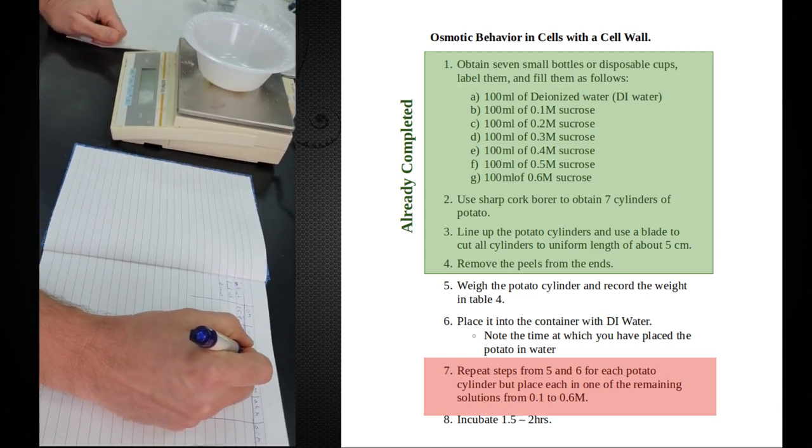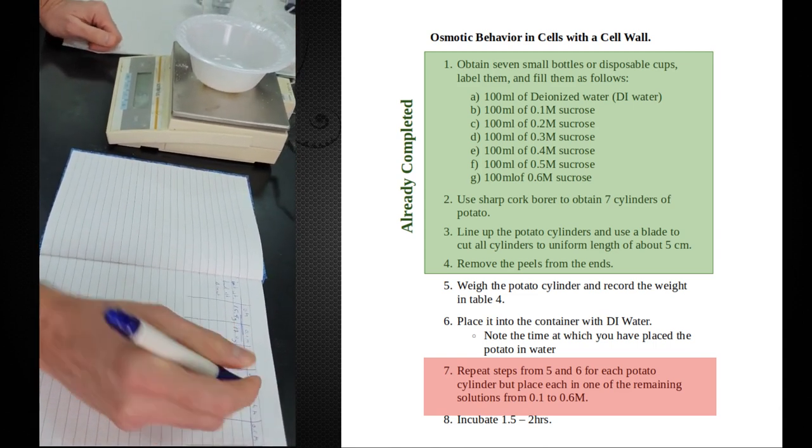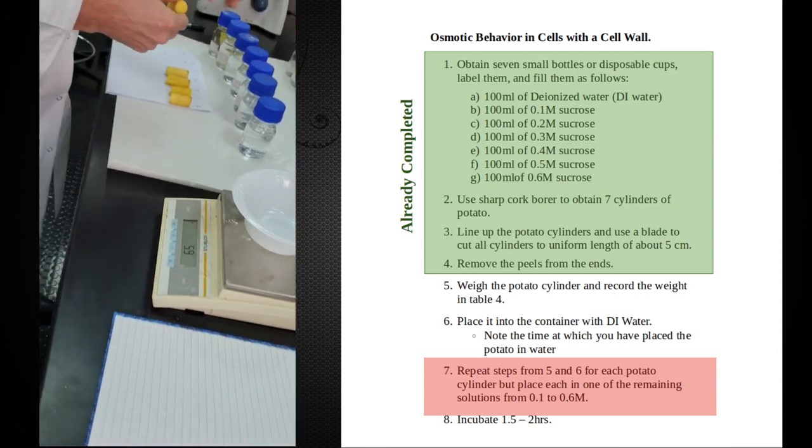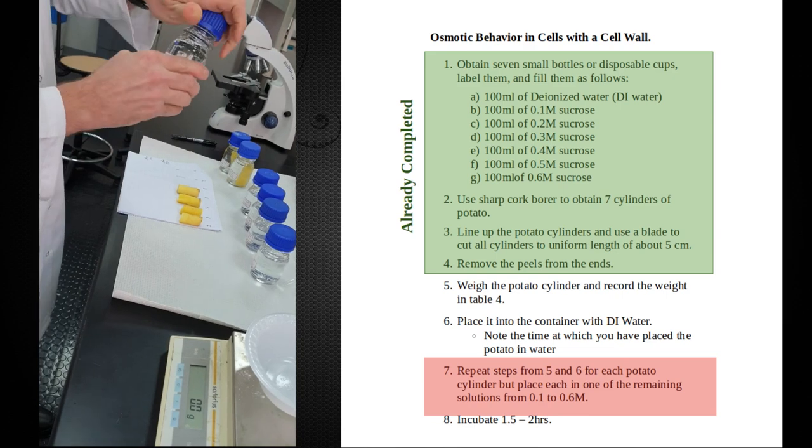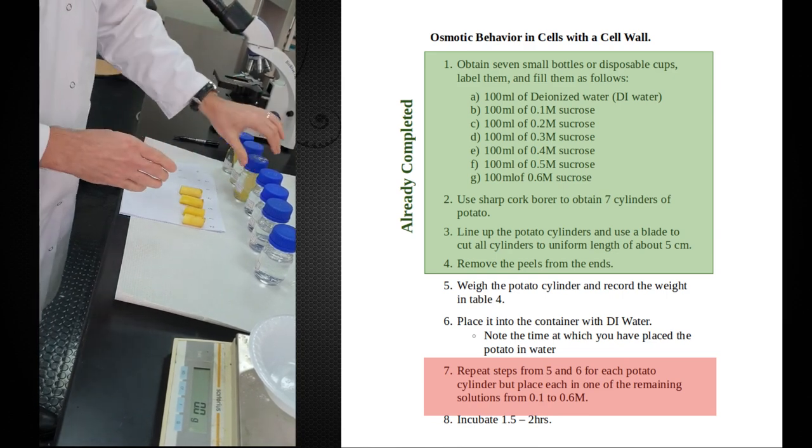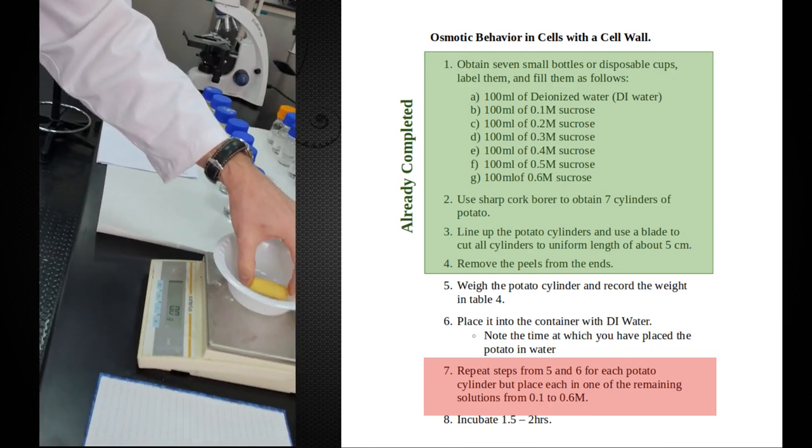So 15.4 grams. Now you'll notice that all of these are different sizes and different weights. And so we will adjust for that with our calculations later on.